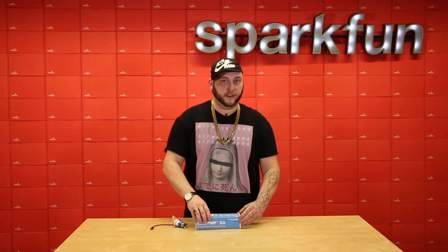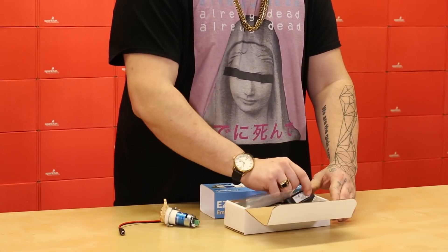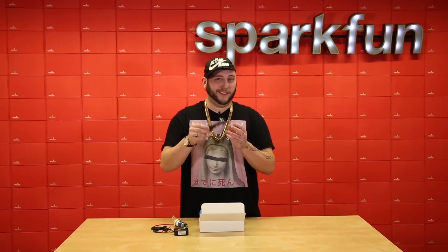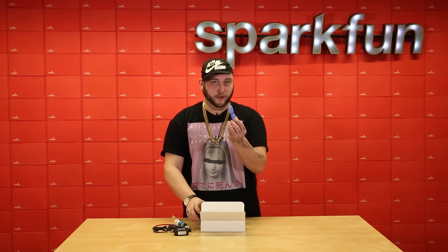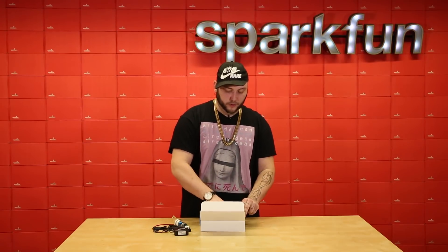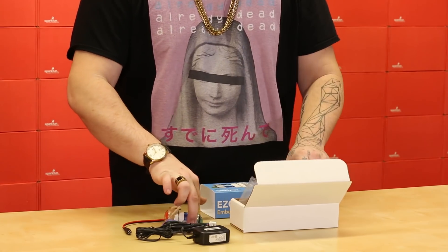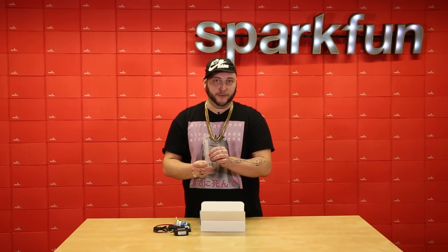Besides the pump itself, the kit also includes everything that you need to get started, including a power supply for the pump itself, a nice long data cable, a longer piece of tubing, two inline tubing connectors to connect that to the tubing that's integral to the pump, and finally, for calibration, this cute little 10 milliliter graduated cylinder.